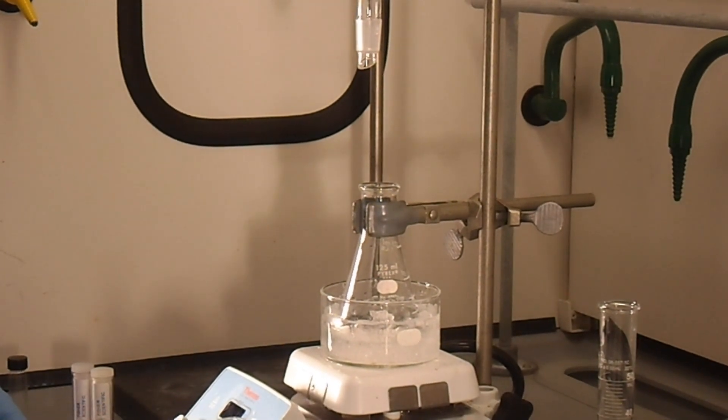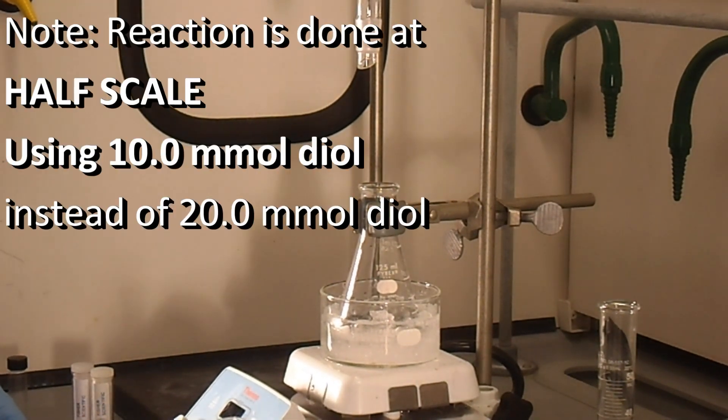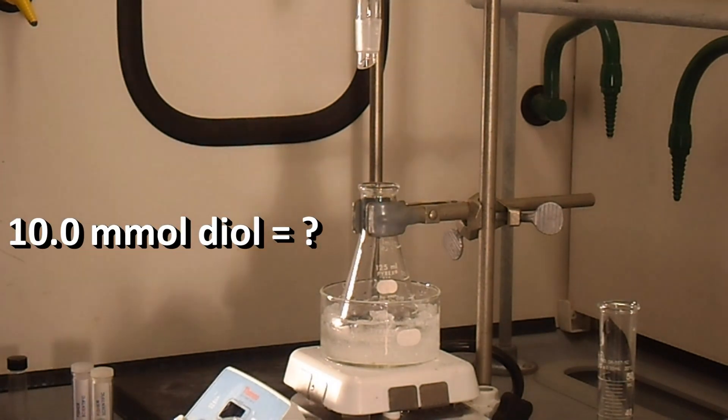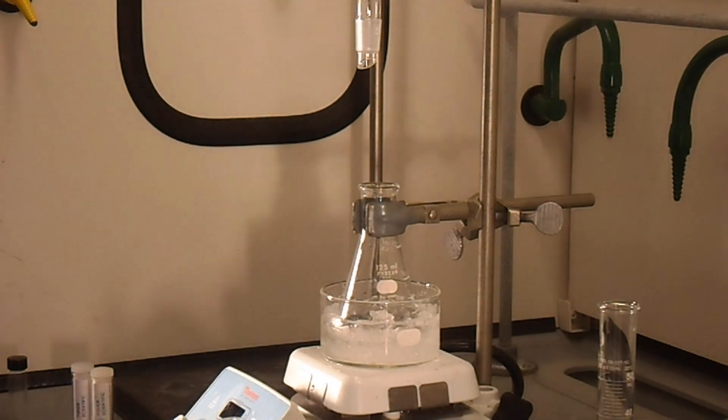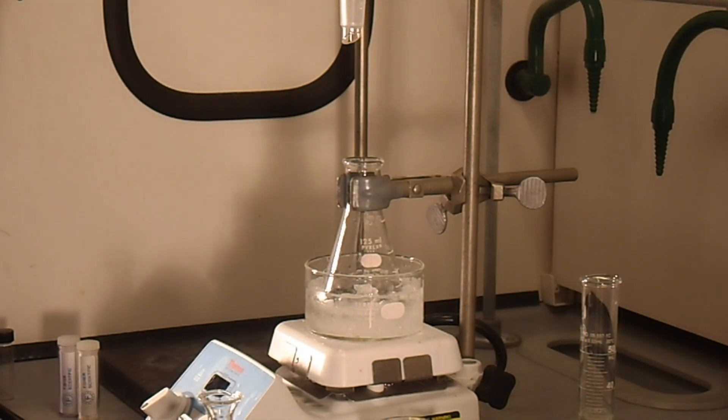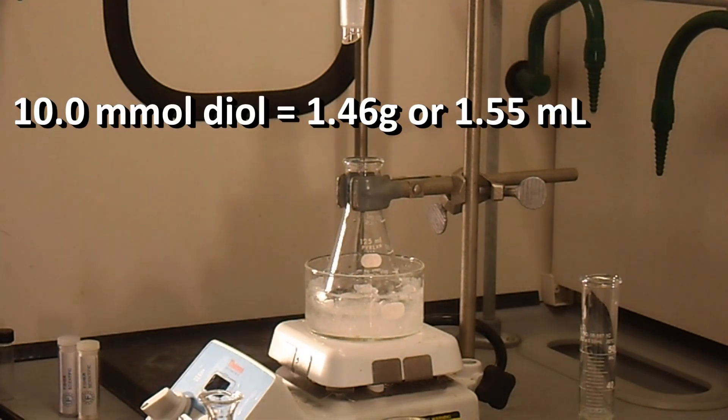We have our Erlenmeyer flask that has our pre-weighed diol. The procedures say to use 10 millimoles of diol. If you could please calculate for me how much diol that is in grams or in milliliters. You should have come up with at least 1.4 grams of diol or 1.55 milliliters of diol.